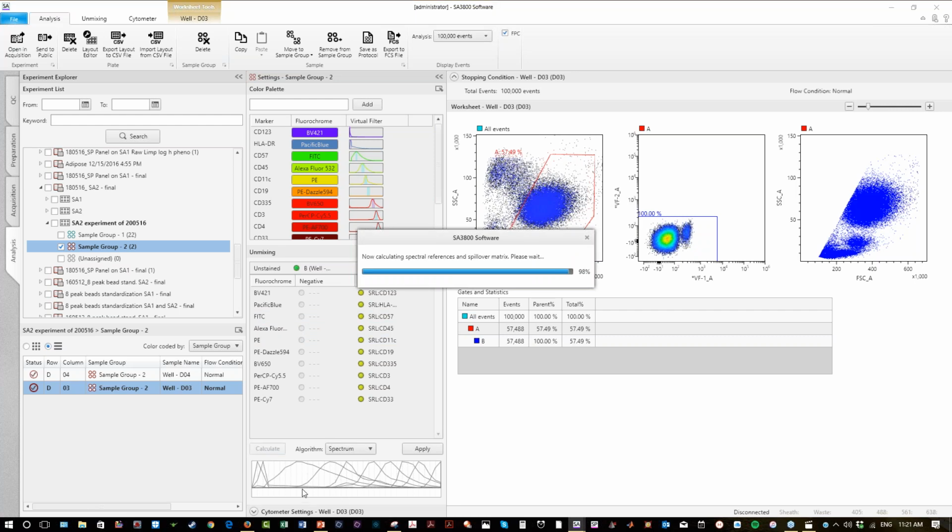Now what you're going to see at the end of this calculation is that there will be a purple population sitting within the curve. This purple population is the curve or the color of autofluorescence. It has a unique shape to it based on the type of cells, and that's due to any oxidation items, the way you fix it, the way you may permeabilize it, and the NADH and the FADH of that particular cell. So though we continue to complain about autofluorescence, it actually has a lot of power to it.